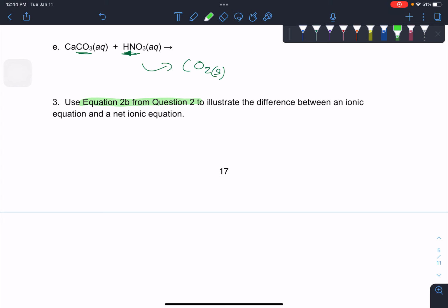You could argue it is a chemical change because it's going from a solid state to an aqueous state, and heat change is observed. But you have a good point, that's on the borderline in terms of a chemical reaction. It really boils down to intermolecular forces, ionic forces versus hydrogen bonds or ion-dipole forces, which have different strengths on the reactant and product sides.